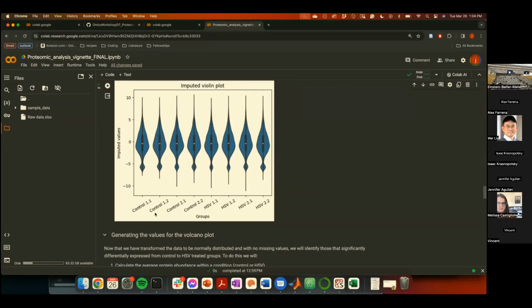The reason that little bubble of imputed values is there and not massively at the very, very low end is that if you create imputed values that are really, really tiny, then when you have proteins that, for example, are barely detectable in one condition and not detectable in the other, and the non-detectable values are imputed, you get a fold change that is massive, right? Because you have detectable versus non-detectable. And that actually tricks you when you interpret your data, as it looks like proteins that are really enriched where they are barely detectable. You don't want to encounter that risk.